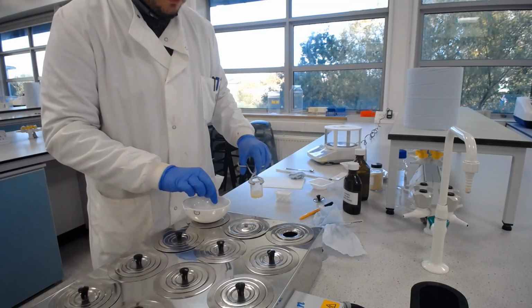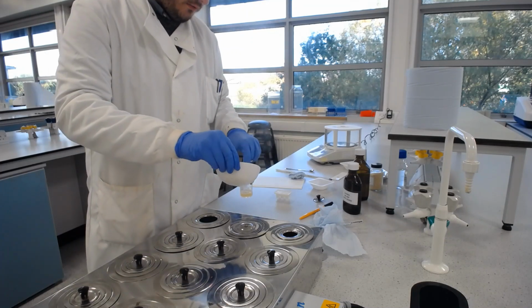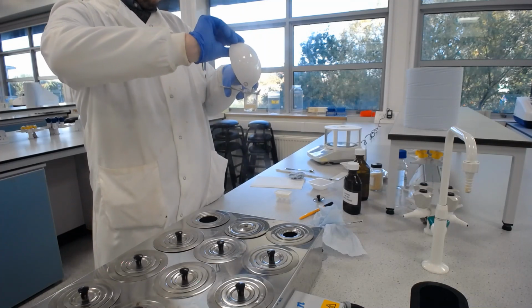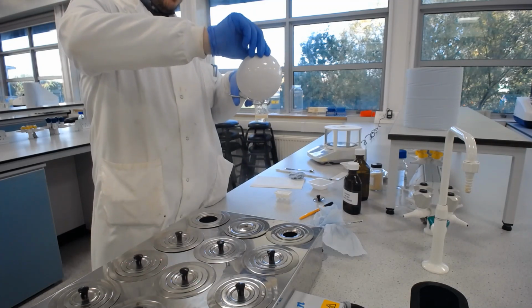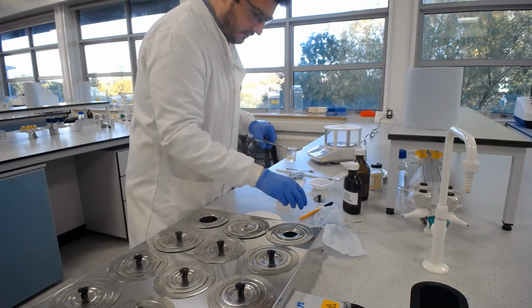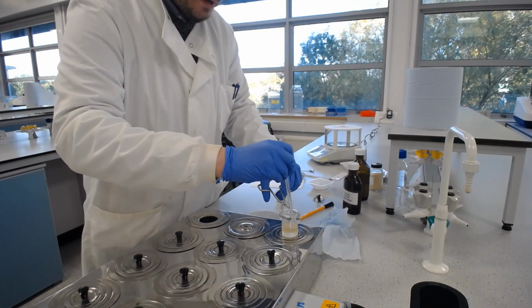So I'm actually happy to hold this evaporating dish. If you're not, make sure you pour it the other way. So I'm going to pour that straight into here. It just minimises the waste that I'm going to get. More than one way to crack an egg. So let's put that in there, and get my stirring rod again, and I'm just going to make sure that's all nicely mixed.